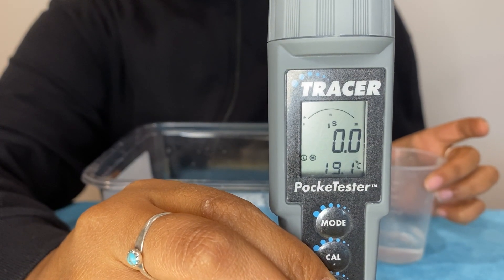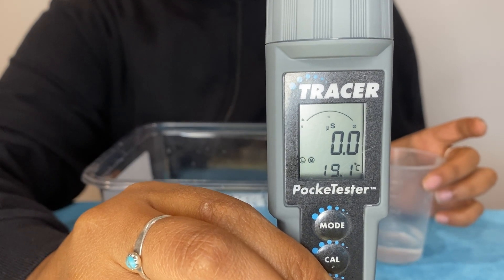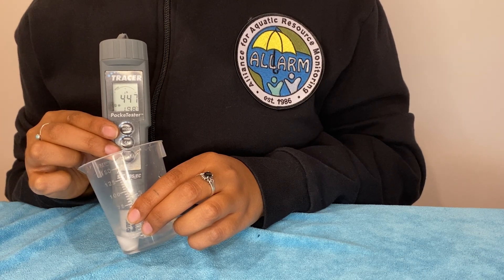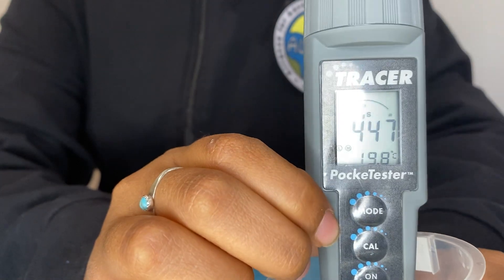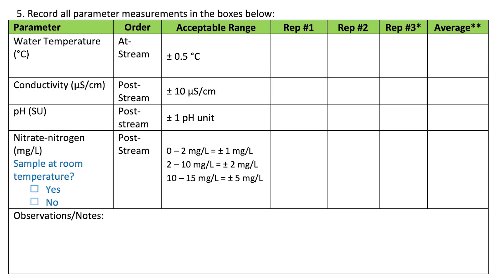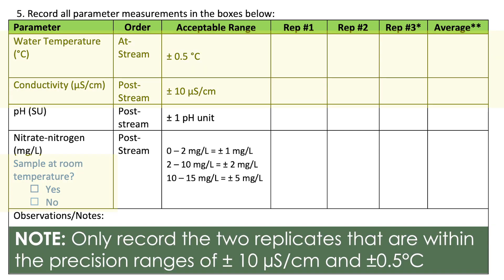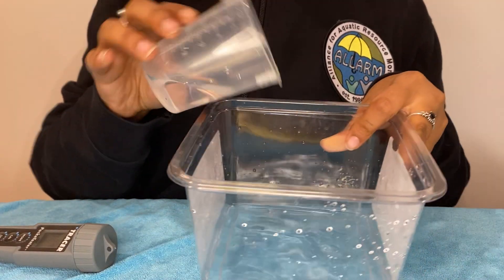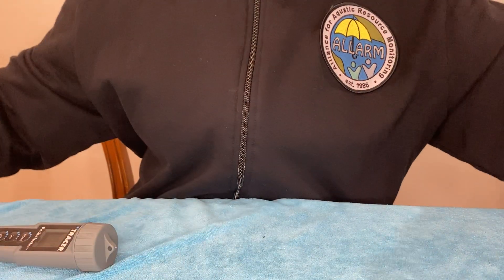You can now test your water sample for conductivity. Place your meter into the water sample and wait for the reading to stabilize. The temperature reading will be at the bottom of the screen whether you are testing at home or stream side. Record the values you received onto your data sheet. Only record the two replicates that are within range of each other. For conductivity, the precision range is plus or minus 10 microsiemens per centimeter, and for temperature it is plus or minus 0.5 degrees Celsius. You can now pour the contents of your beaker into the liquid waste bucket and proceed with other water quality tests.